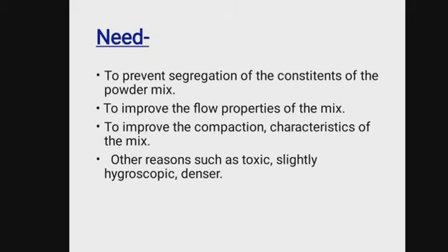Need of granulation. What is the need of granulation? It is needed to prevent segregation of constituents of the powder mix, or to improve the flow properties of the mix, or to improve the compaction characteristics of the mix. Other reasons are that the material may be toxic, slightly hygroscopic or denser.